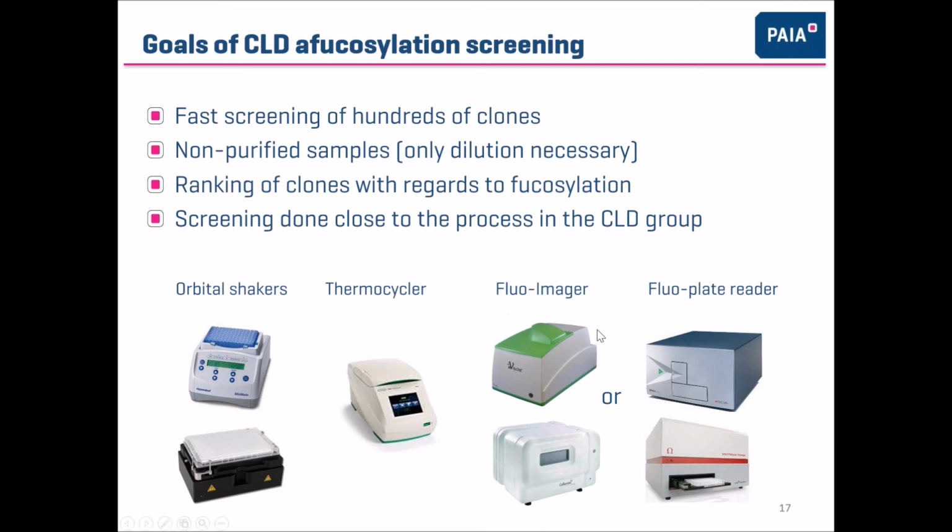Either that can be a fluorescence imager from Cytena, or also a fluorescence plate reader can be used, like from Tecan, from Molecular Devices. This is an instrument from BMG, exactly, yeah. So different kinds of equipment can be used to run the assays and to read out the plates.